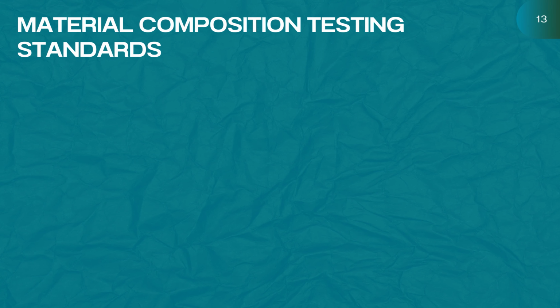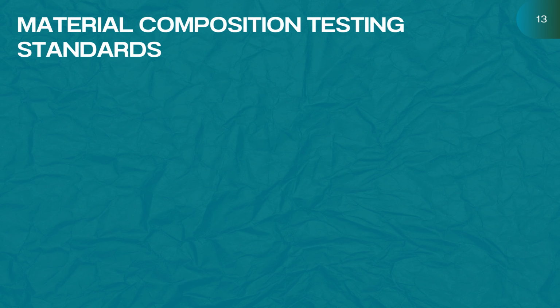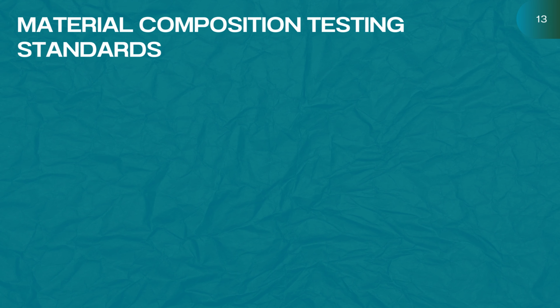There are various standards based on which each test is performed, mainly from ASTM, ISO, and EPA. These ensure consistency, accuracy, and global acceptance of results. For OES, standards like ASTM E415 are used to analyze carbon and alloy steels, ideal for clean, flat metal surfaces. XRF testing follows ISO and RoHS-related standards, great for metals, plastics, and environmental samples.